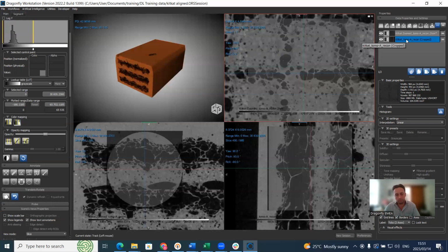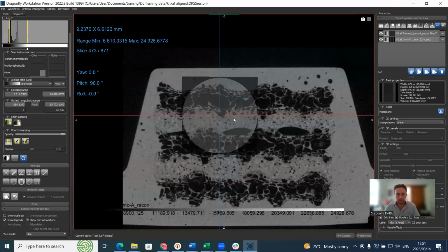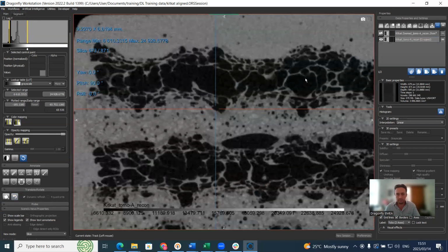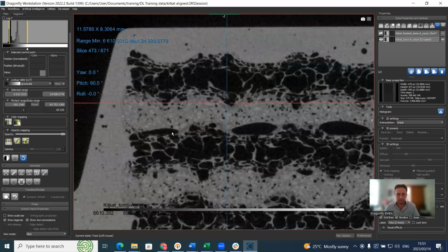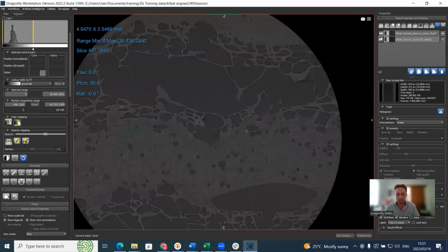Now, the important thing for a super resolution model, we're going to be using a UNet model for super resolution training. The same UNet model as before, using regression. Basically, what we do is we tell the model that this is the input data, and this is what we want as output, this kind of quality.